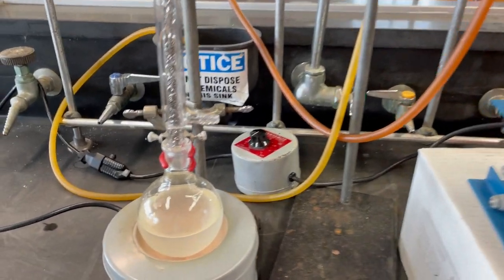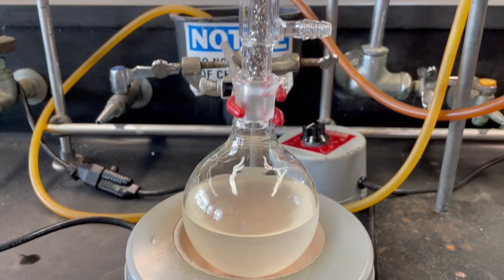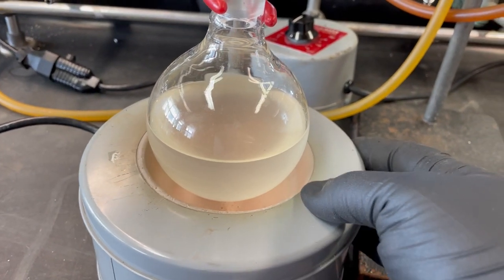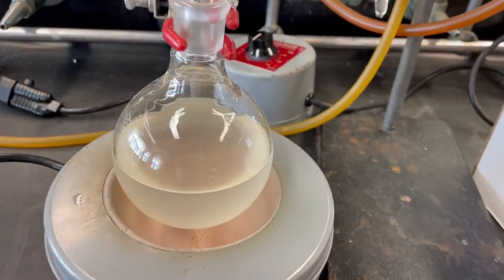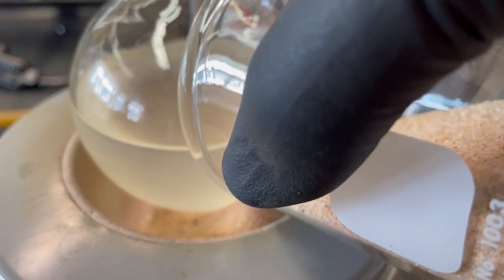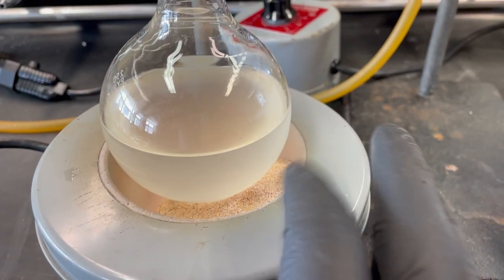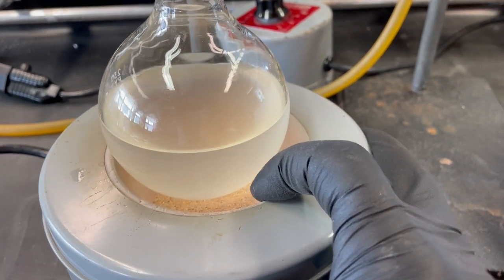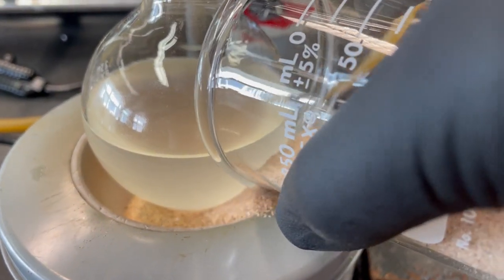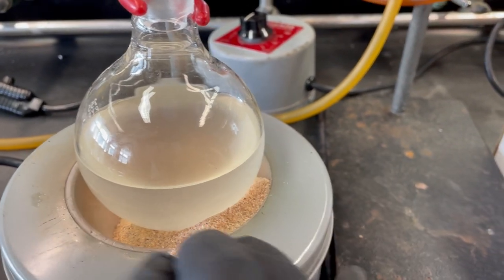Okay, so I went ahead and put all of that ethanol sugar pasteurized salt solution inside of that round bottom flask. We're gonna go ahead and use a sand bath. So what I did here is I left a little gap for me to basically be able to pour it in there, because I want to get it kind of low in there, and I don't like wiggling it around so much. So I'll go ahead and just do this, and then we'll get it in there like that. That way the round bottom is already inside of this little sand bath portion, and then I can move on with my life once it's in there. Okay, so I'll do that.